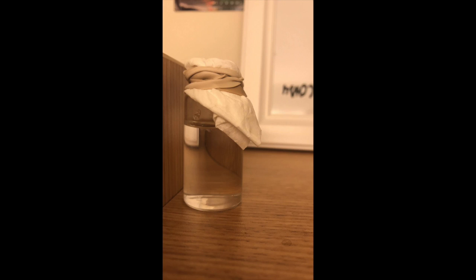Hi, so this is the second Alum post lab video. As you can see from the picture that I imported in this video because I didn't want to disturb the bottle, there hasn't been any additional crystal growth.